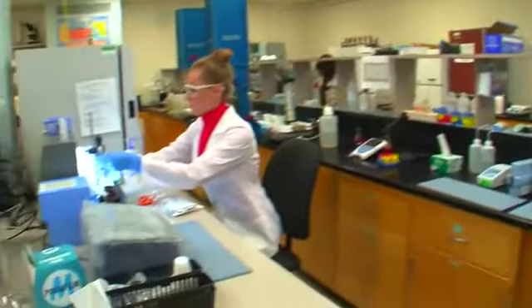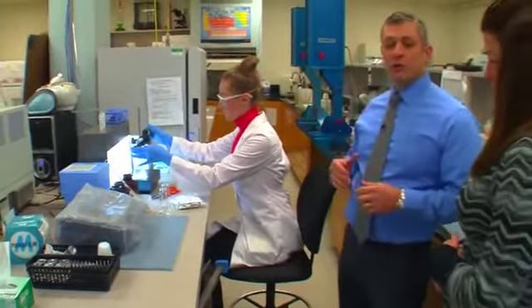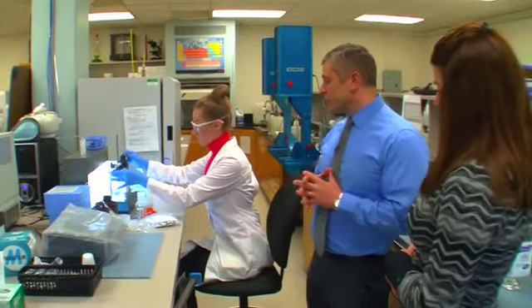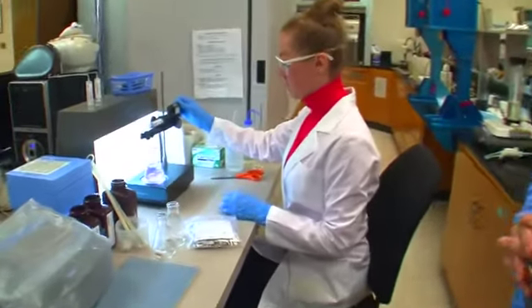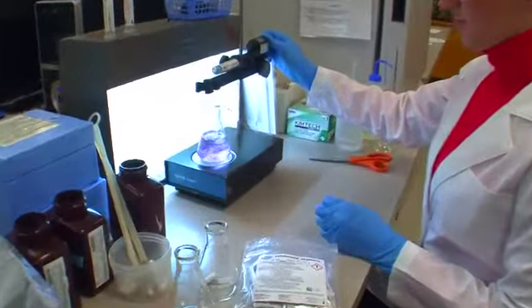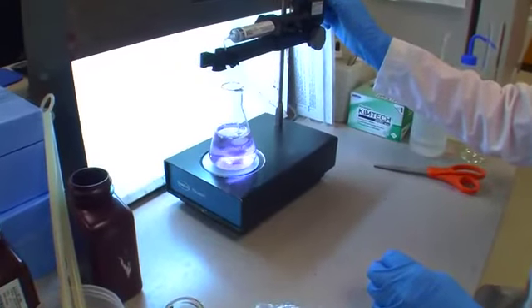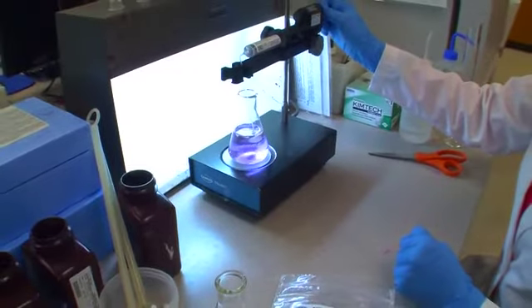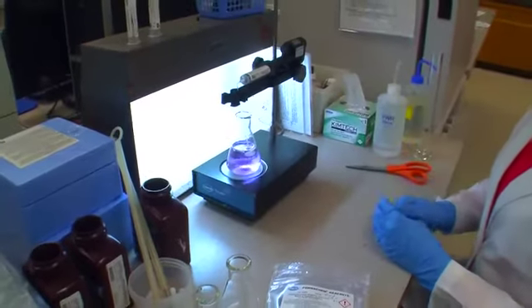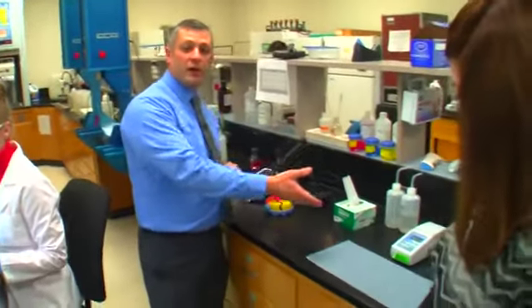This is another portion of our laboratory. We do a lot of weekly chemistries here. It gives us an overall view of the general health or water quality in the distribution system. Here, Amita's doing a titration for chloride. And this, again, is done weekly. Also included in our weekly analysis are elements and contaminants such as iron, manganese, sulfates, pH, turbidity, color. And these are generally titrated chemistries, which are done here at this station, or over here where our pH meter and our turbidimeter is.